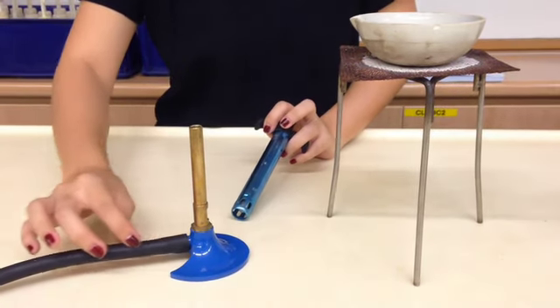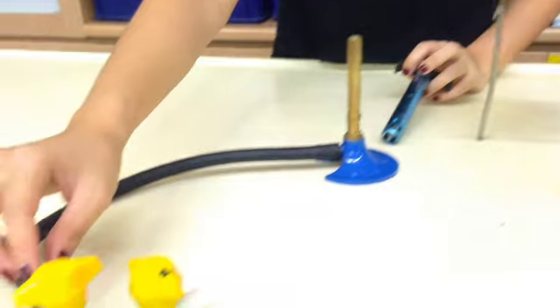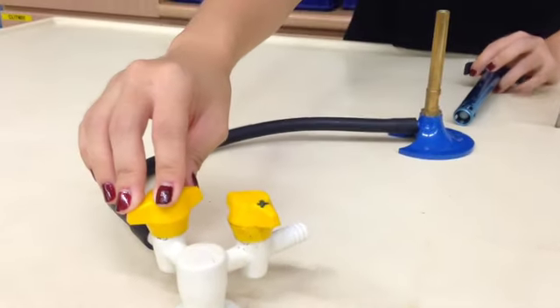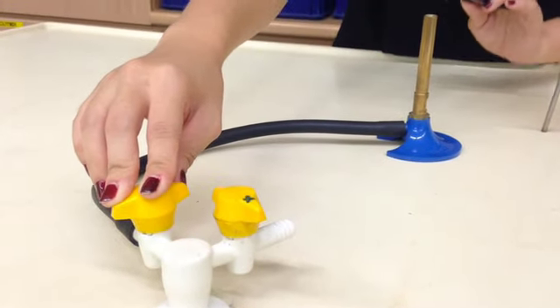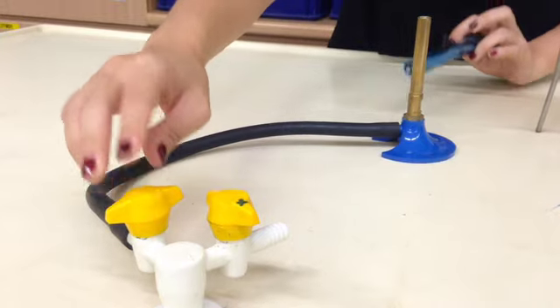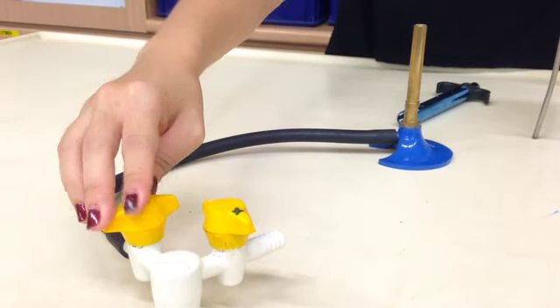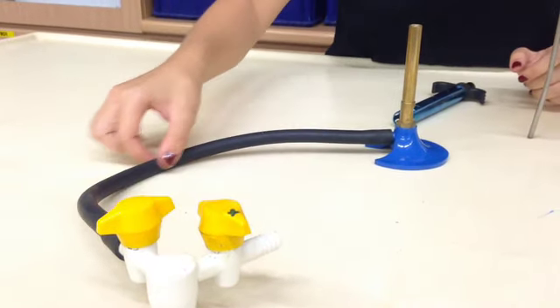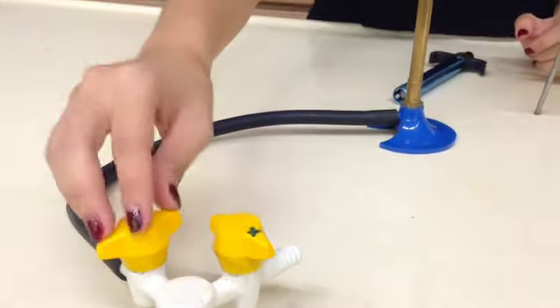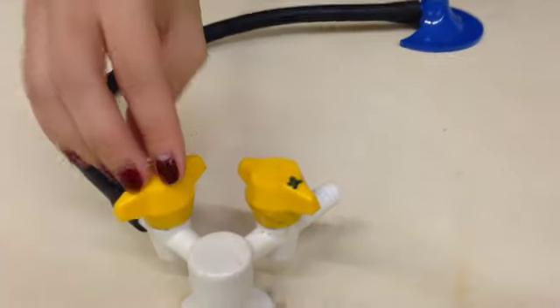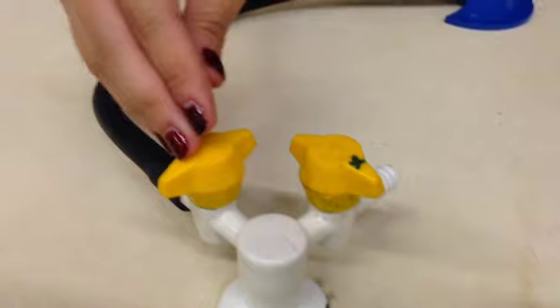For the Bunsen burner, we always have it connected to the gas tab. Make sure that when you turn on the gas tab, you turn on the correct gas tab and light the correct Bunsen burner. The gas tab when it's closed is always perpendicular to the gas line. So make sure that when you turn it off or on, when it's closed, it's supposed to be perpendicular.